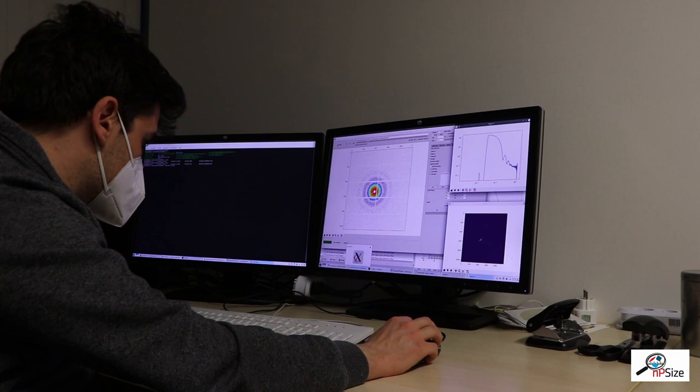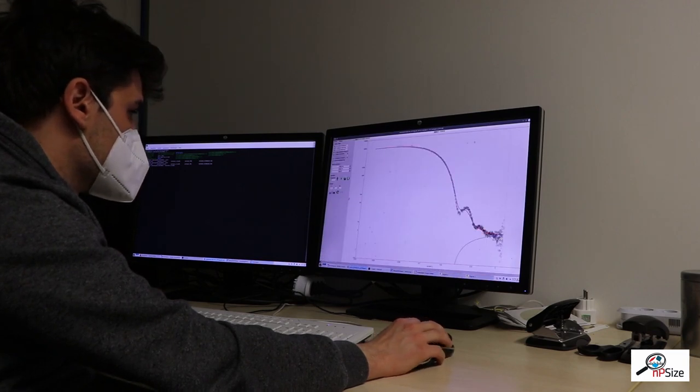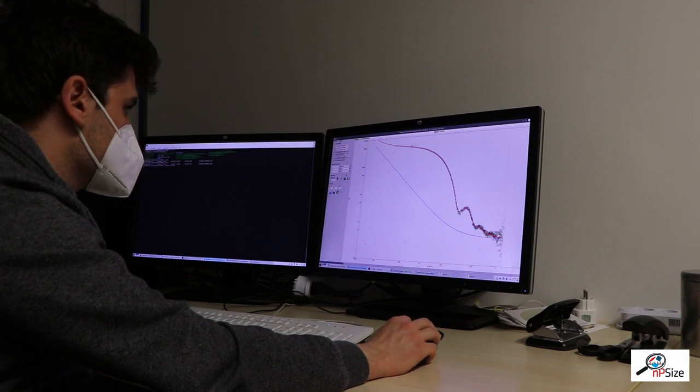Then the scattering curve is loaded into the program for SAXS data analysis. First we select the model for spherical particles and then we start the fitting. This gives us the particle diameter. This analysis is explained in more detail in the video about traceability.